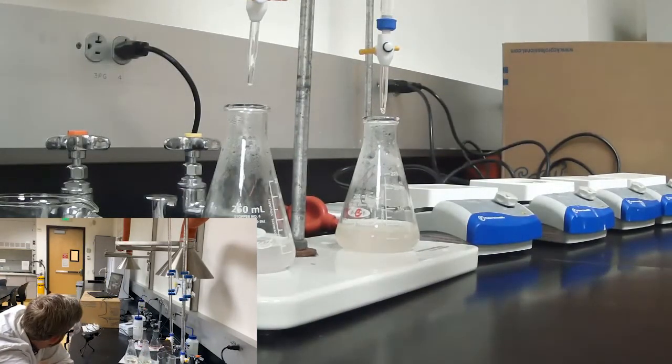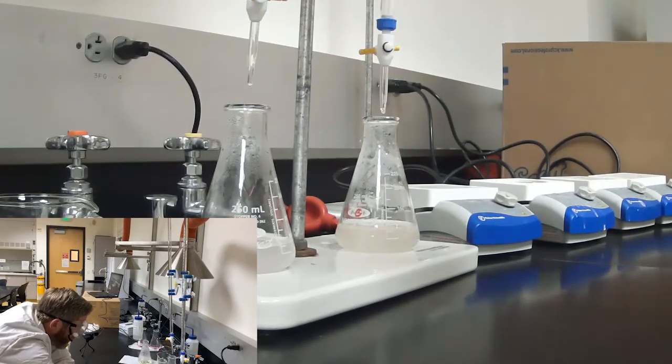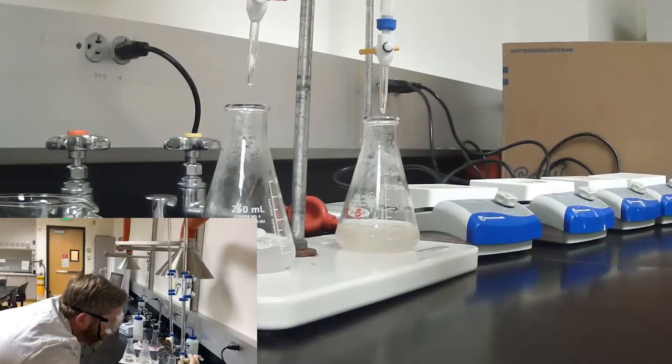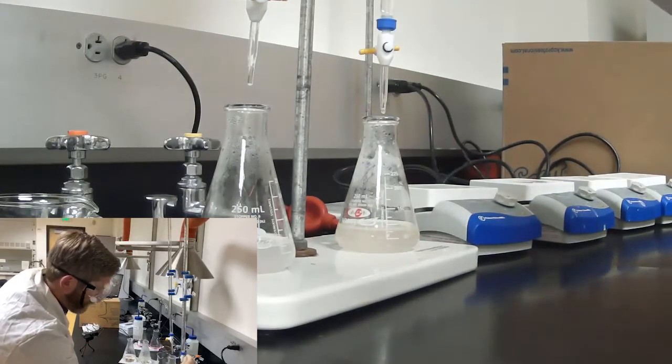Okay, we have completed our color change for sample 1, and as you can see, it's a little bit different, but we have ablated all of the color agent that was in there, so we know we've reached our endpoint. So we'll start the second one. And it's about the same. That's interesting.